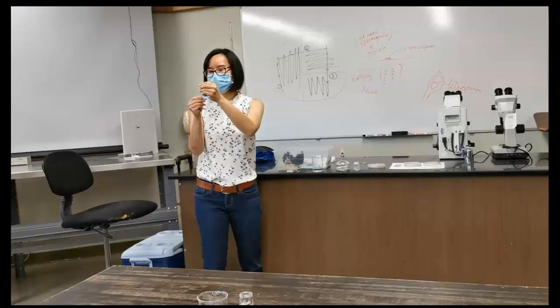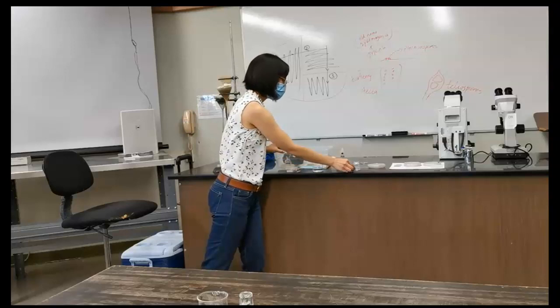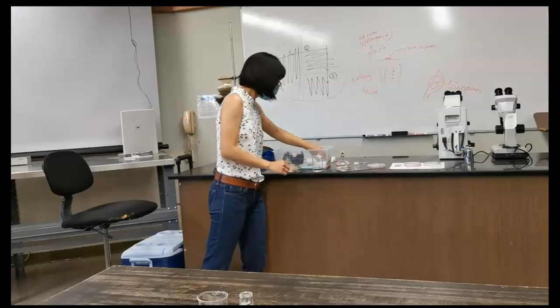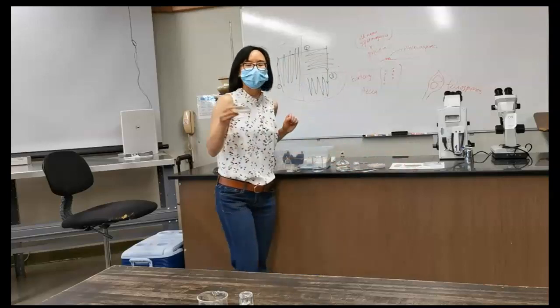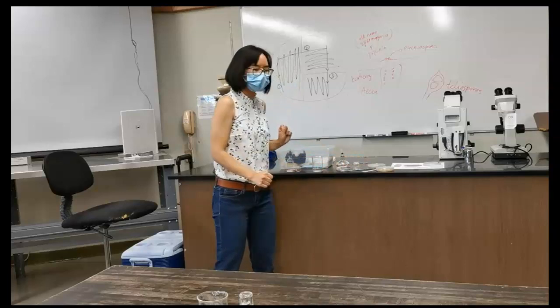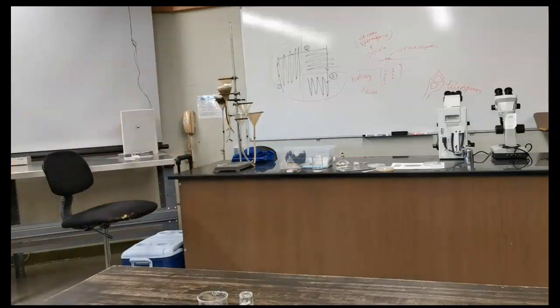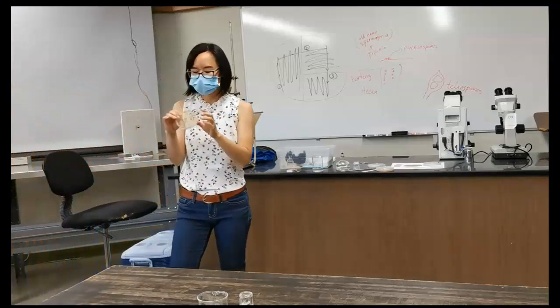Yeah, because later on when you burn it, you don't want to touch it anymore. So that's that. And then prepare your mother bacterial plate. And then I'm going to get a new plate for demonstration, so I will just use this one. You can see that I draw the line here.